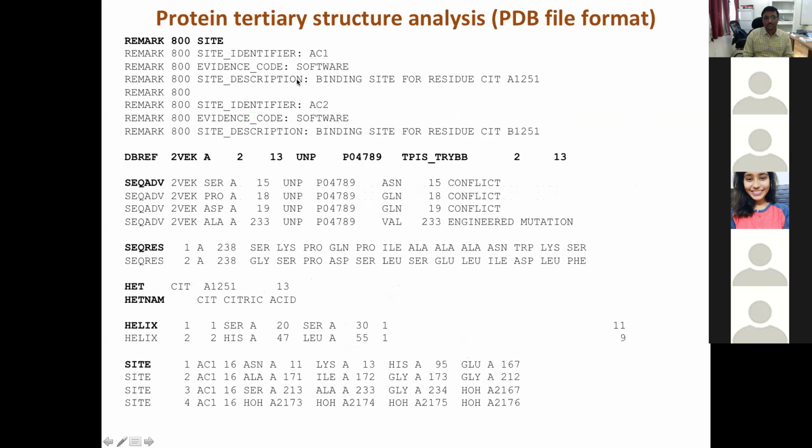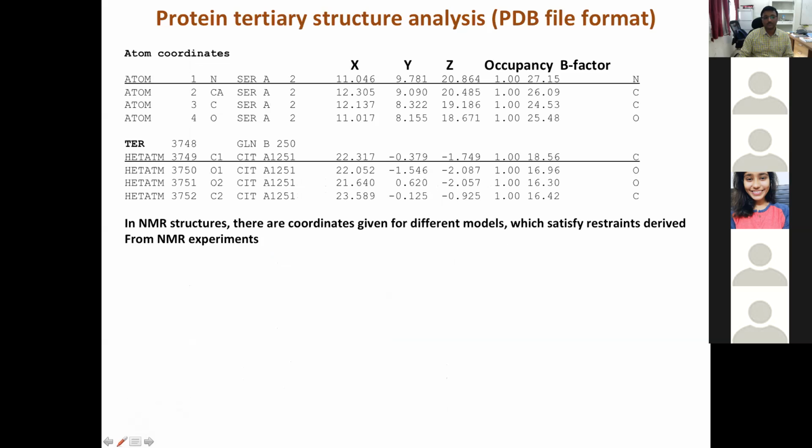For instance, if you see over here, the first residue that you have is serine, right? The second residue is lysine. However, in this particular residue ID numbering, you see this serine has a residue ID of 2. So this serine, even though in the sequence it should ideally have been numbered 1, is not numbered 1. And I told you the reason.